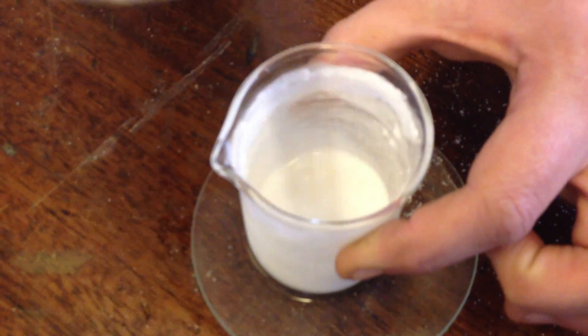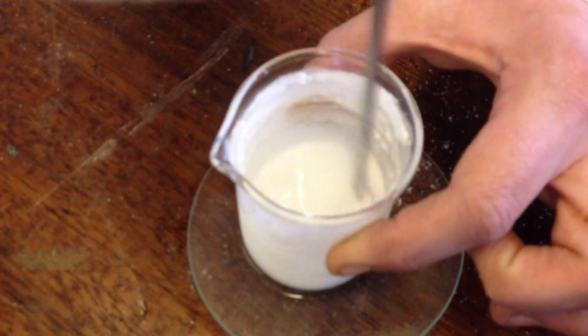As you can see now, it's completely liquid. It's very cold to the point that I can now pick up the watch glass because the water has frozen.